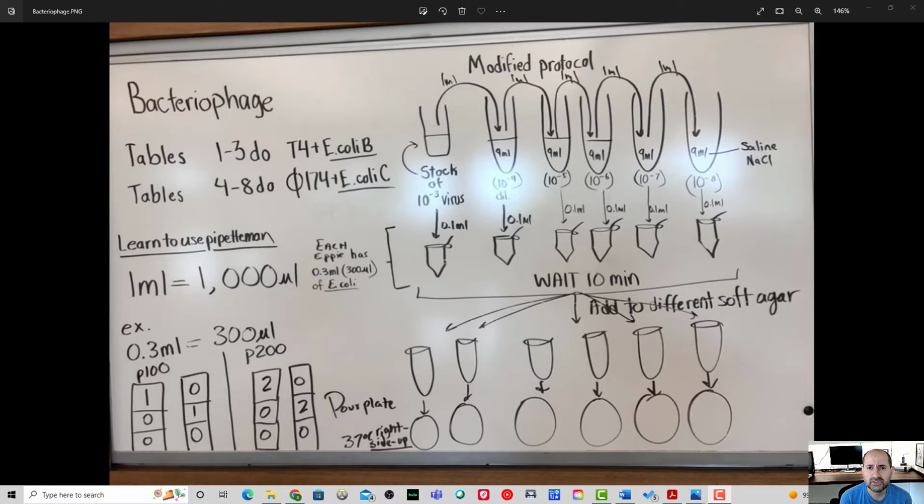One thing you need to know is, like I said, what is a bacteriophage? Another thing is, what is a plaque? And remember, plaques are lytic events. These are clearings in the bacterial lawn or in the agar plate where the virus has switched to the lytic part of its life cycle and lysed the bacteria. Remember, when you held these plates up to the light, they kind of looked like Swiss cheese. There were clearings in the bacterial lawn. These bacterial clearings are called plaques.